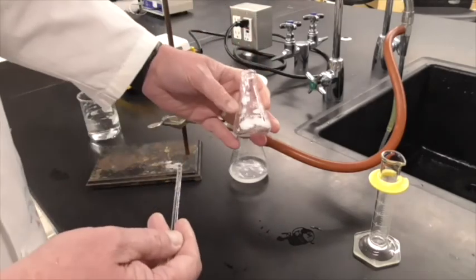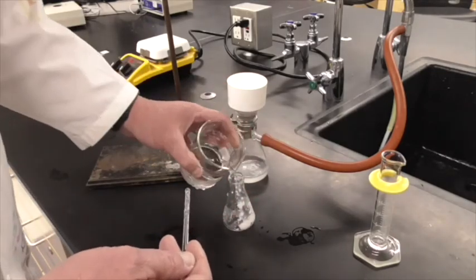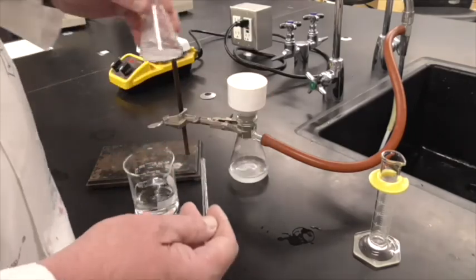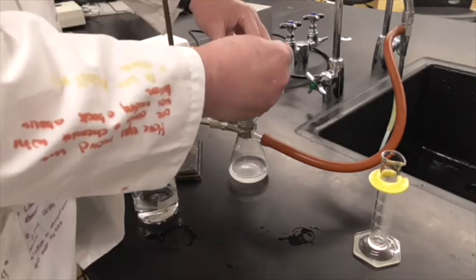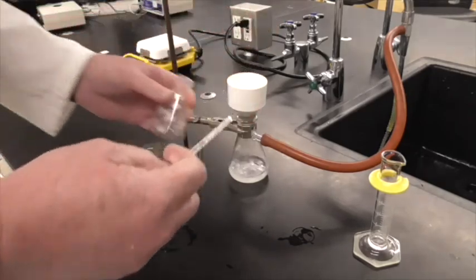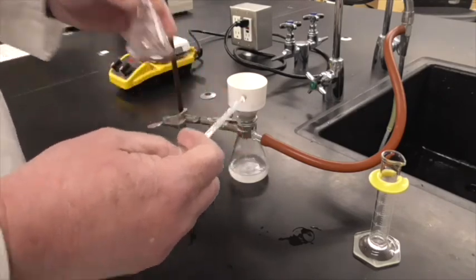So we can see there's some aspirin still in the flask, so I'm going to add a little bit more cold water and swirl it around a bit. I'm going to do this a couple times to see if we can get most of the aspirin out of the flask. Okay, still got a bit in there. I'm going to add just a little bit more cold water and swirl it around.